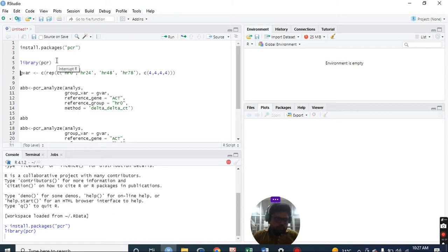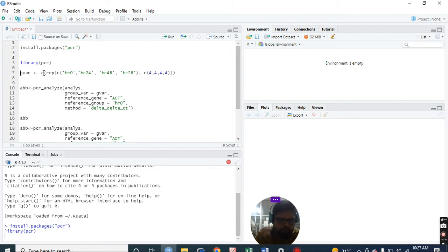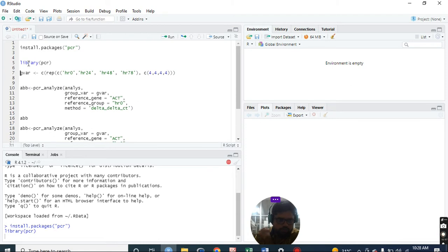First we need to make a variable - a group of variables. Suppose we have 0 hours with 4 samples, 24 hours with 4 replicates, 48 hours with 4 replicates, and 72 hours with 4 replicates. This is a vector - replicates of these vectors, and each replicate is repeated 4 times. This is the whole code for this.